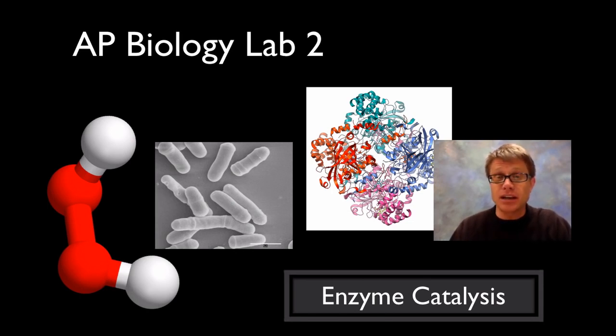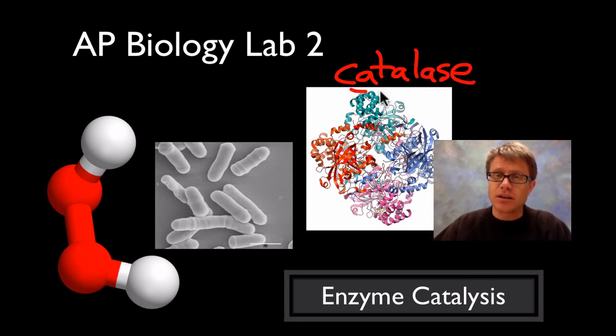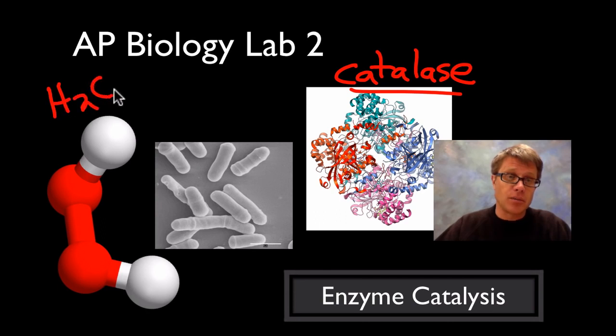This is on enzyme catalysis, so it's basically the enzyme lab. The enzyme that we'll be studying is something called catalase. Catalase is an enzyme that's found in almost all living things, and its job is to break down this chemical. This chemical looks a lot like water, but we've got an extra oxygen, so this is hydrogen peroxide.